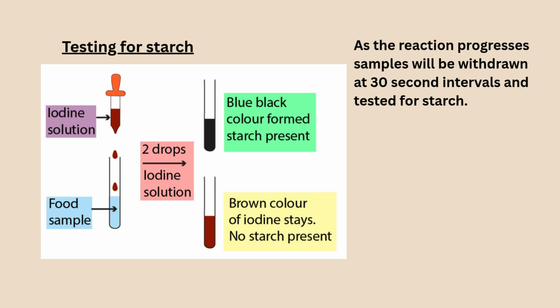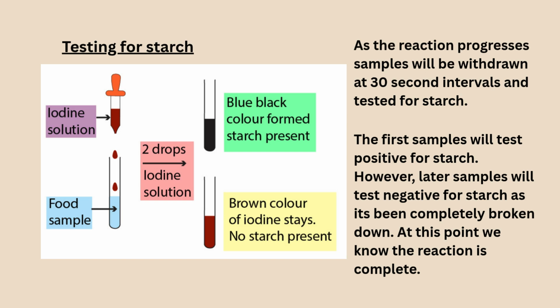As the reaction progresses, samples will be withdrawn at 30-second intervals and tested for starch. The first samples will test positive for starch. However, later samples will test negative for starch, as it's been completely broken down. At this point, we know the reaction is complete.